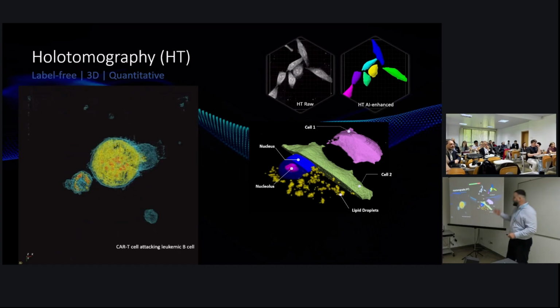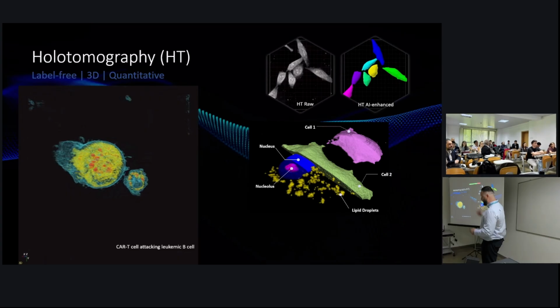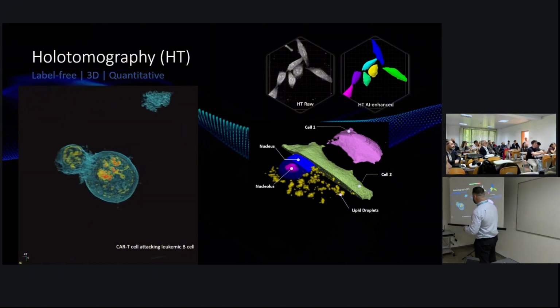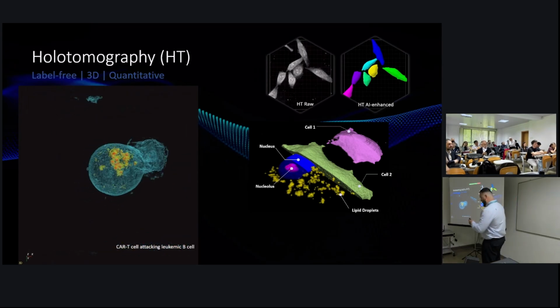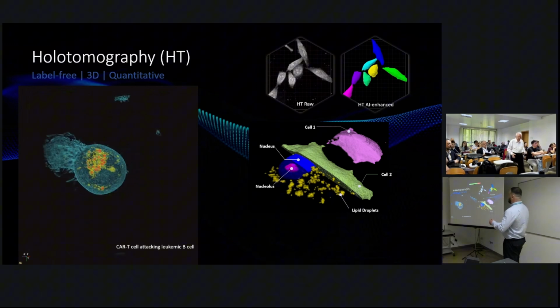So what happens here is live imaging in 3D, where a T cell is attacking a cancer cell. And you see the interaction between the 2 cells in 3D. And upon that interaction, you'll see that those really dense objects inside the cell start increasing within seconds. So you can do this over time. In reality, the data looks like this.